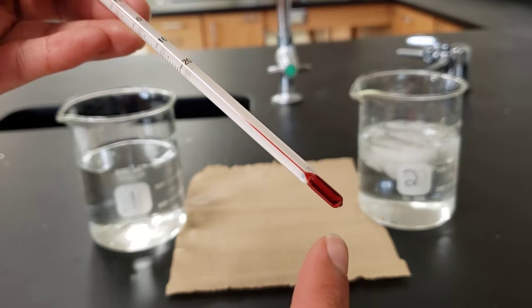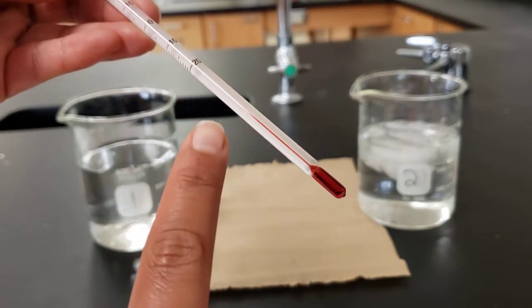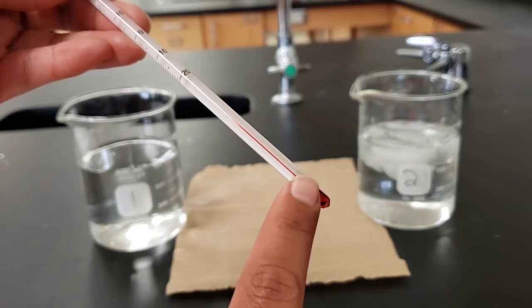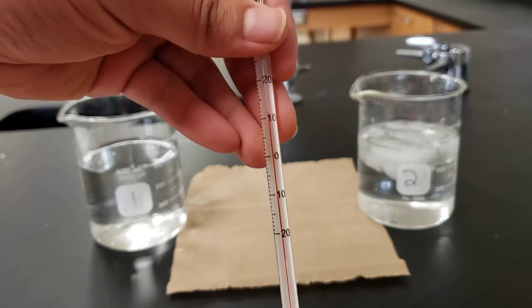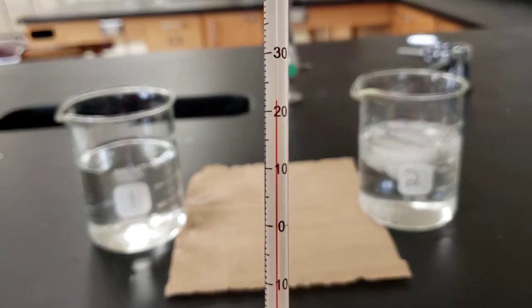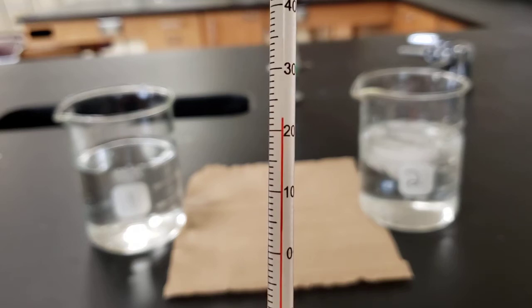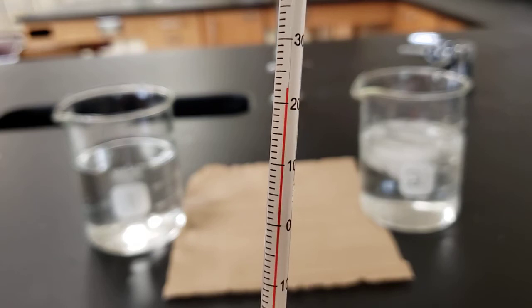Thermometers used to be made with mercury, which is a very toxic substance. So that's a huge no-no nowadays in the lab. This is filled with colored alcohol instead. And you'll notice that there's a red line that goes all the way up to a certain point, and wherever it meets a number, that tells you what the temperature is.